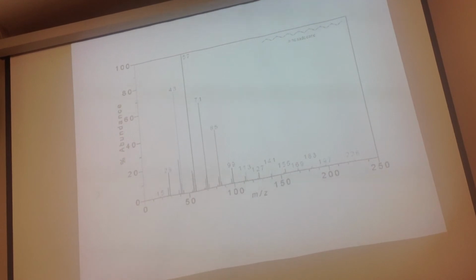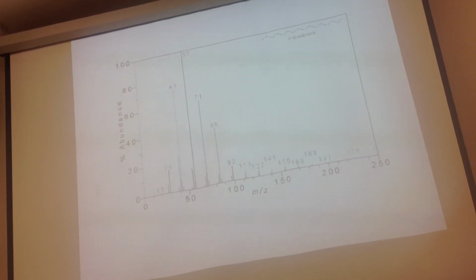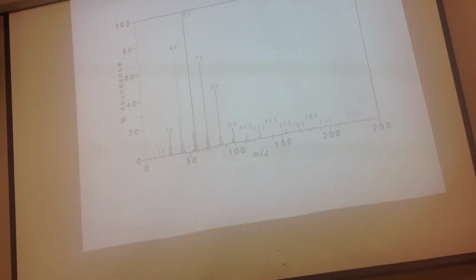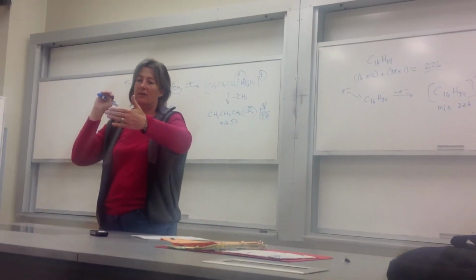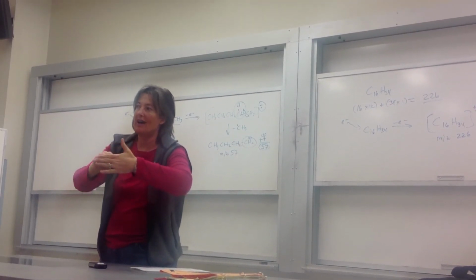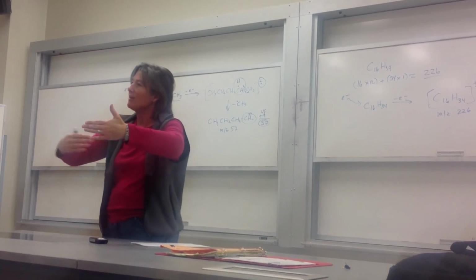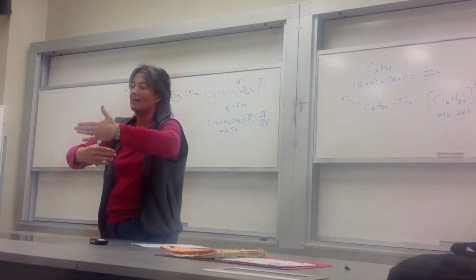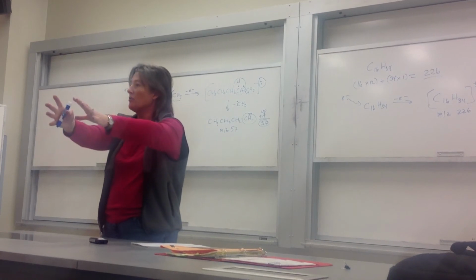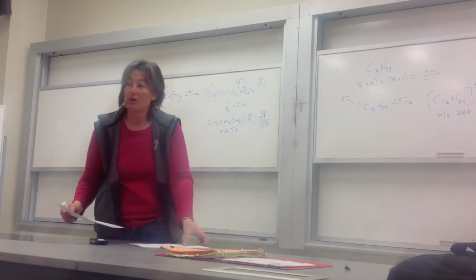Is it possible for something that's really big like that to get kind of double bombarded? Like it'll break apart and then one of the fragments will get hit as well? Well, if that happened, you'd end up with a +2. I don't think so, because once the electron beam hits, you make the parent, and the parent starts traveling. So it can't get double bombarded because the electron beam is in behind it. So once you create that carbocation, it's moving onwards, and there's no more bombardment moving on, which is good.